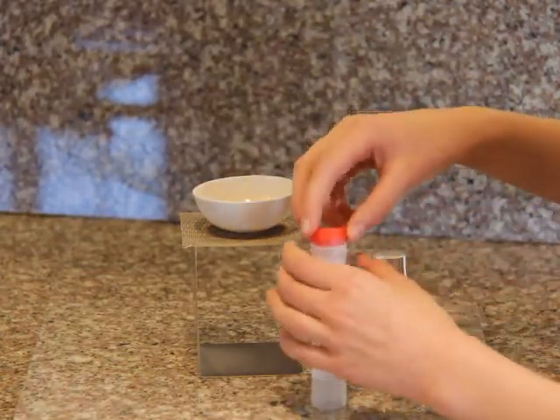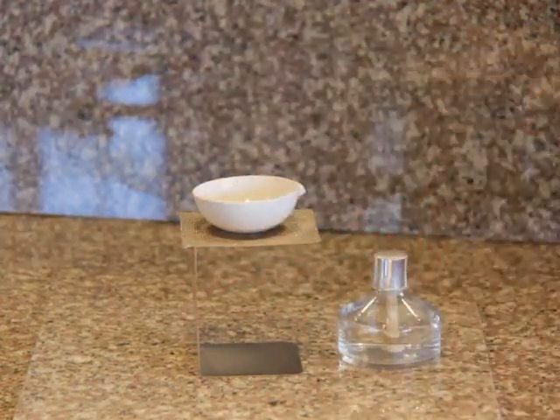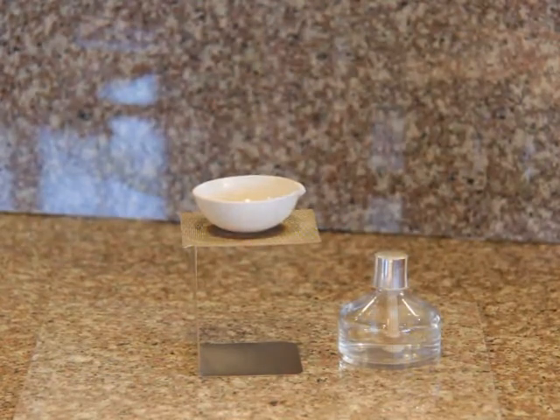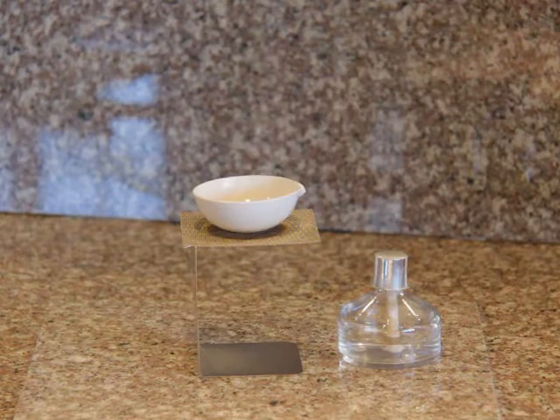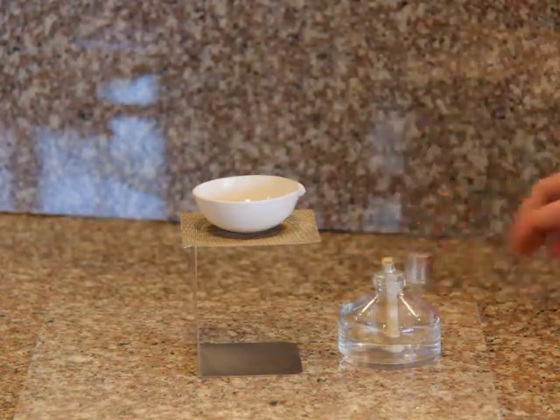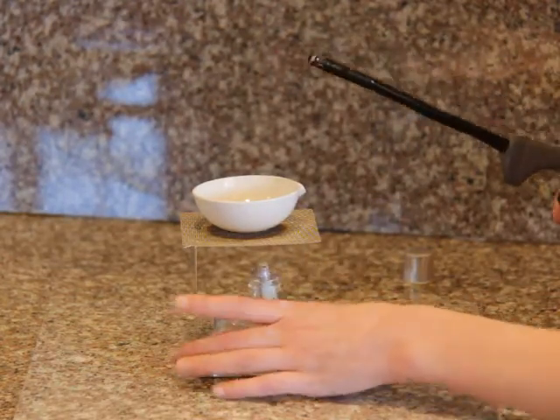Remember to clean your measuring spoon in between your two different chemicals. Next, light your alcohol burner and begin to heat these two chemicals. You will notice a piercing odor that you didn't notice in experiments number six and seven. It is the same smell you will get when you open a bottle of ammonia solution. Remember to use good ventilation during this and turn on your fan.